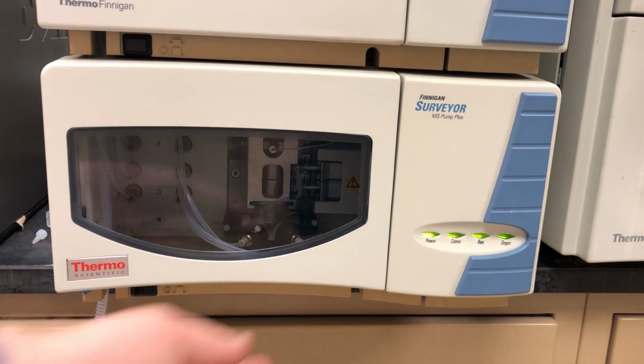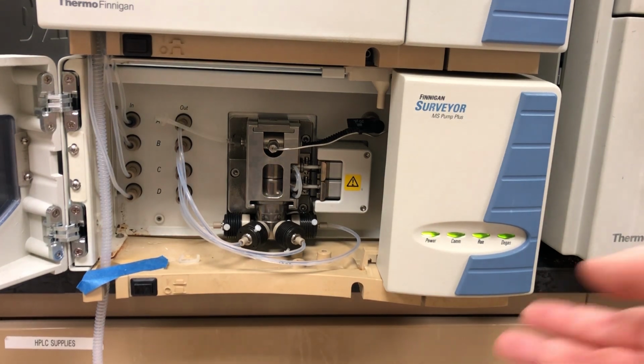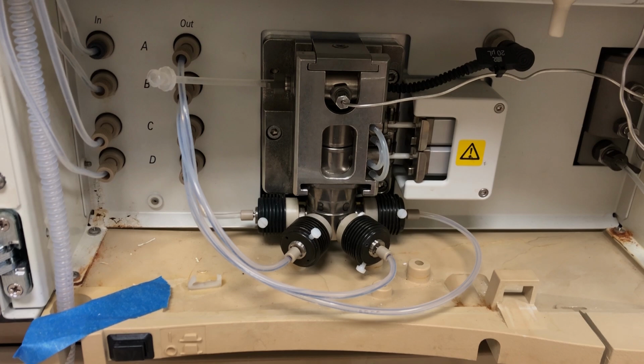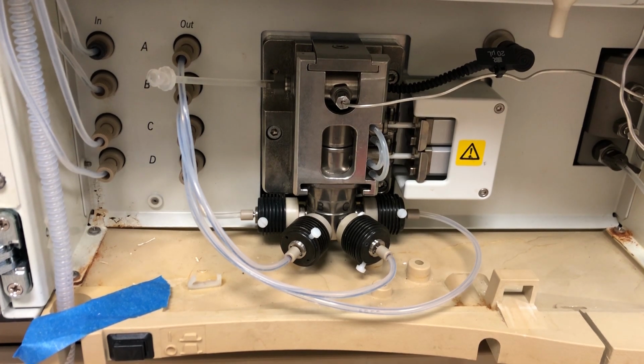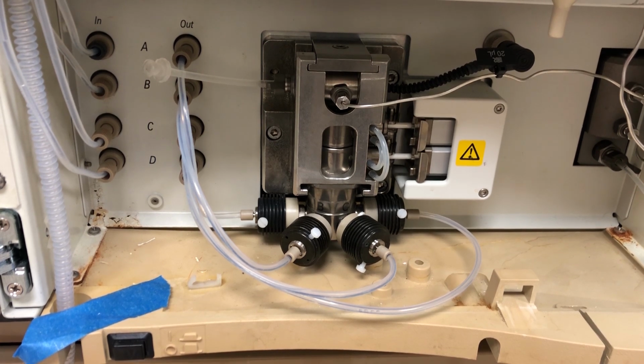So our pump unit's on the bottom here, and if we open up the covers, we see these piston valves inside, and we see these tubes labeled ABCD coming in from the solvent up top. So we've turned the pistons on, we've turned the pump on, and these pistons move back and forth, and they pull solvent in a very controlled way from those bottles of solvent up on top. And the pump is what really makes the system work.